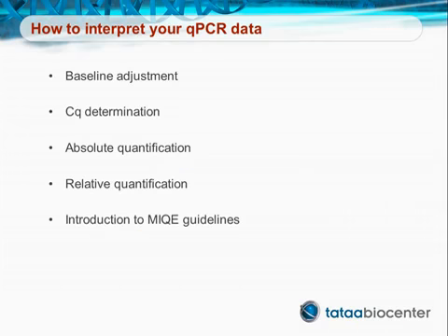During this webinar, we will talk about how we can interpret data from a qPCR experiment, the pretreatment we need to do, and the most common quantification strategies used for qPCR experiments. Finally, we will also talk about the usefulness of the MIQE guidelines.